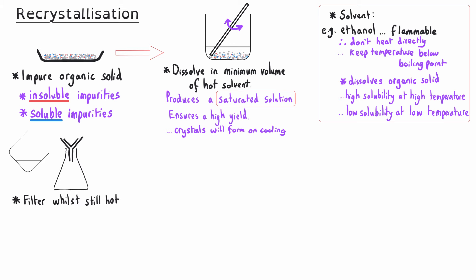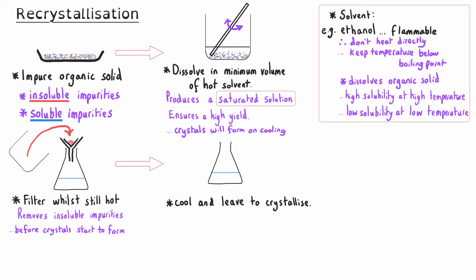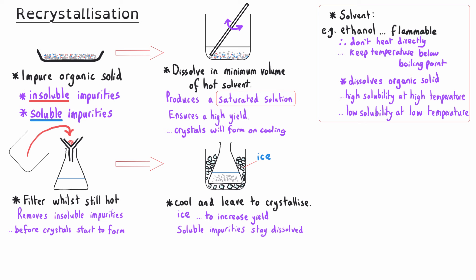Once we've dissolved our crude organic solid, we need to filter it whilst it's still hot to remove any insoluble impurities from our solution. This must be done before any crystals have started to form, because if crystals had formed and we then filtered, we would be filtering out some of the crystals we want to produce. We then allow our filtrate to cool and leave it to crystallize, potentially in cold water or an ice bath. This increases the yield of crystals that form. Meanwhile the soluble impurities ideally stay dissolved in the filtrate.